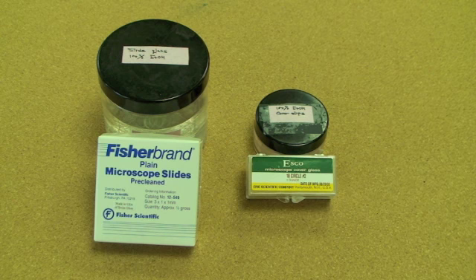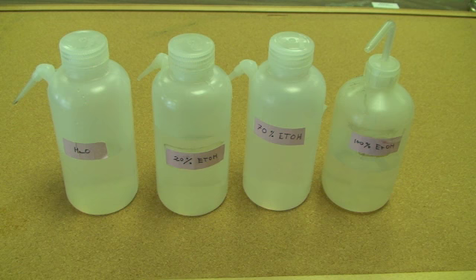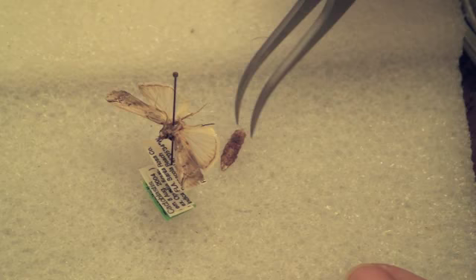In our previous video of the male, we discussed the tools, supplies, and reagents needed for making dissections and slide mounts. We also demonstrated the method for removing the abdomen and placing it in a vial of potassium hydroxide for softening overnight.